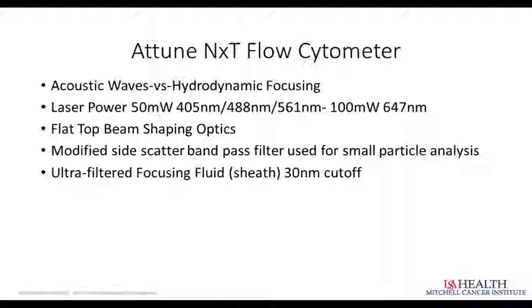And another advantage of the acoustic focusing is that it gives us very, very discrete control over the speed with which our particles are flowing past the laser beam. So the benefit of that is that the Attune can actually process samples much faster than just about any other cytometer on the market. For us, the flip side of that is that we can now slow them way down.